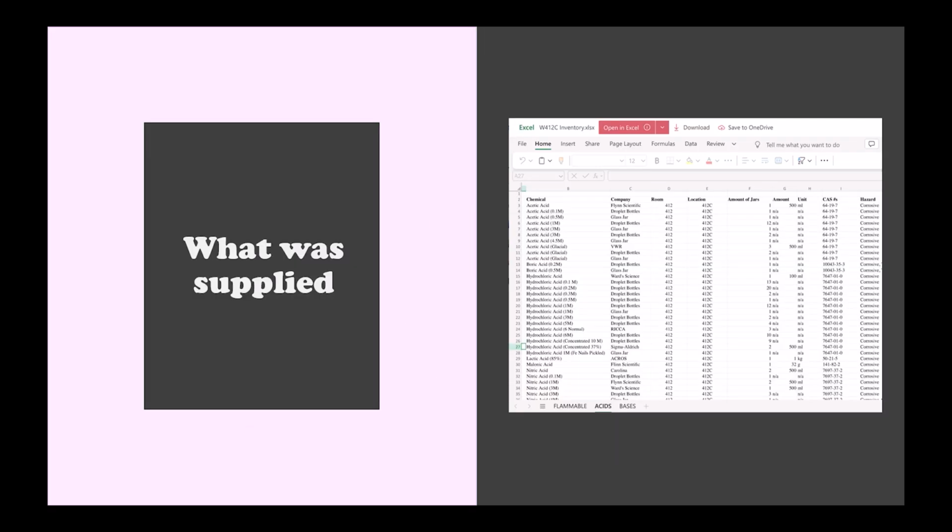When starting this project, I received 10 Excel spreadsheets that were attributed to each room that the Chem Lab had documented. I then took the spreadsheets and created this ER diagram. Through the information that was given, I was able to separate the information into 4 entities: chemical info, user, item, and location. User I created outside of the information I was given, but we will need it for user login.